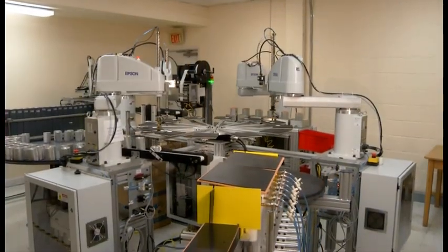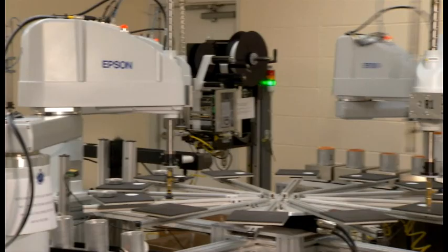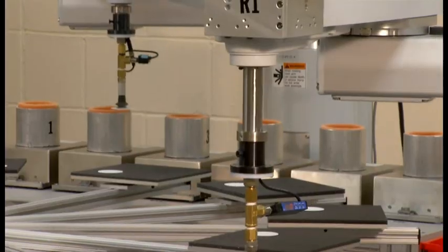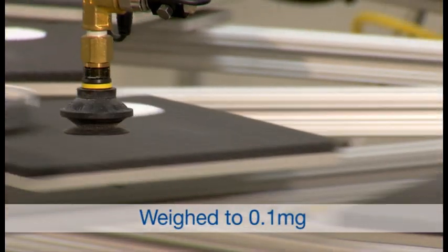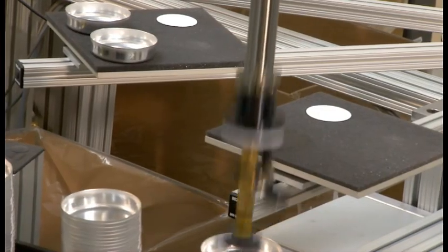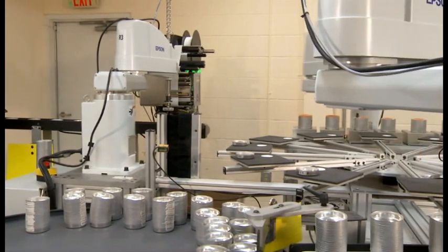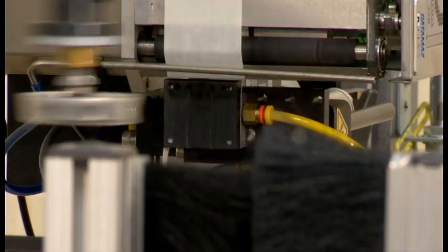Individual filters are transferred to a climate-controlled, state-of-the-art robotics room in which the weighing and packaging procedure takes place. Each filter is inspected with a robotic vision system and transferred to a tared balance for weighing to 0.1 milligrams. Once the weight is stabilized, the data is recorded and the filter is placed in an aluminum pan. A data label is applied to the pan which contains a unique ID number, along with the weight. The label is bar-coded for convenience in the laboratory.